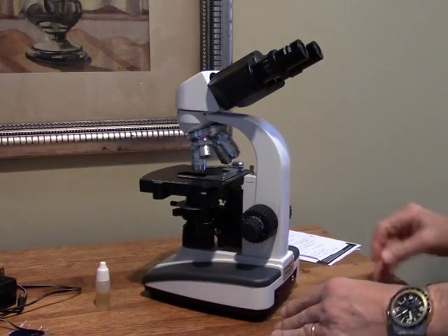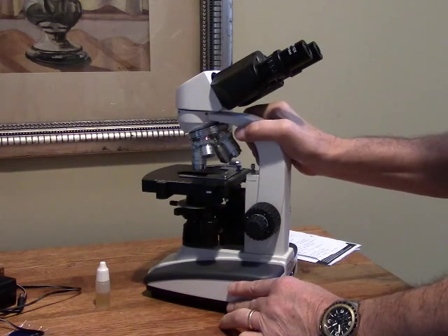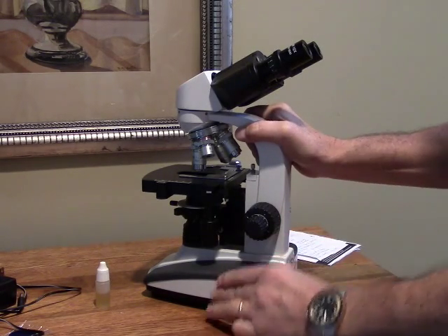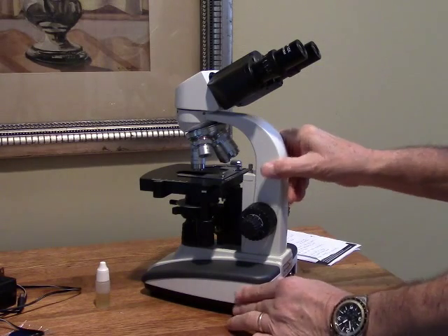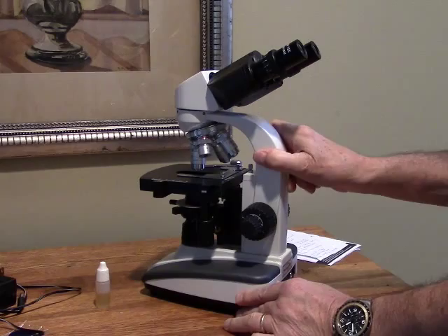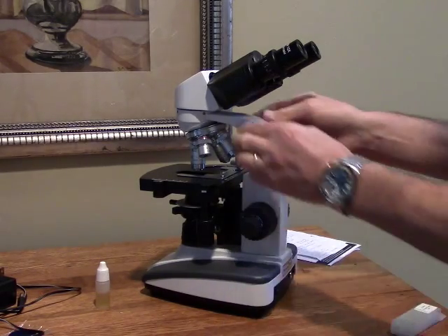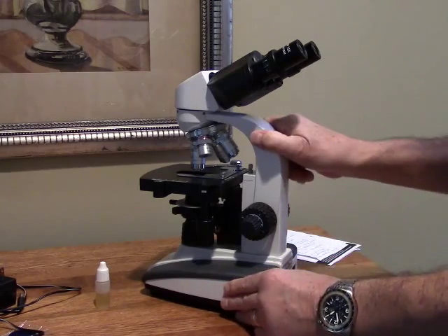The microscope itself is quite robust in construction. This is a great student microscope and it's great for enthusiasts as well. It's a very reasonable price and yet for that low price it's quite competent. This has a mostly metal body on it — a little bit of plastic up top but everything else is pretty solid.